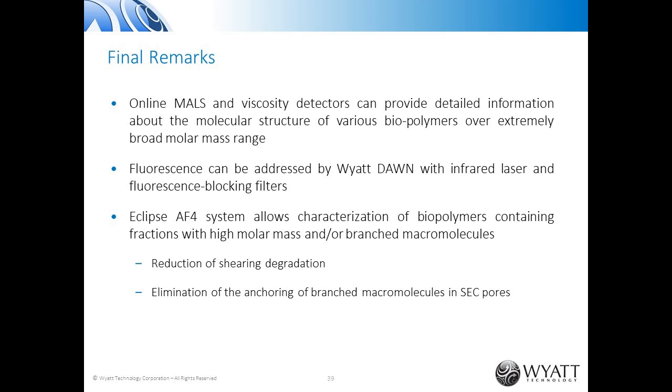Yeah, so of course you can use a UV detector as well, but the UV signal can be even too strong and it can get saturated. So I would always prefer the RI detector, which is more general, and I would always use the RI signal, but UV can be used as well, of course, as a concentration detector.